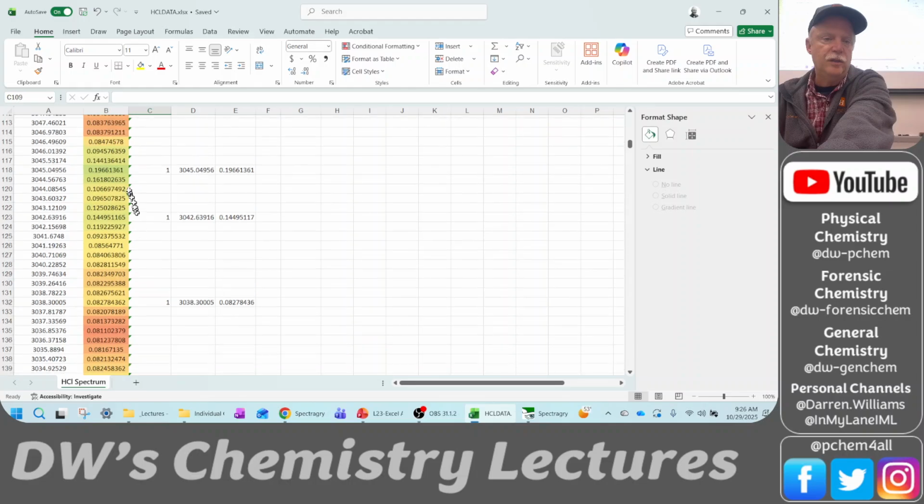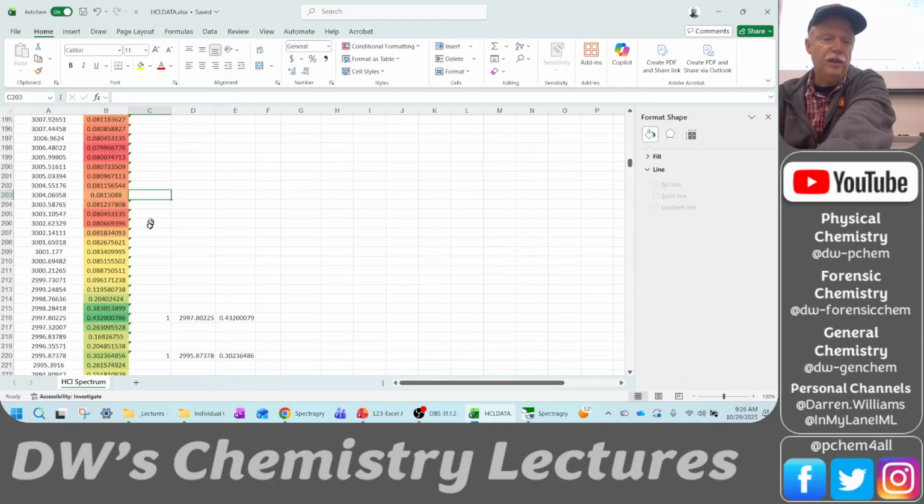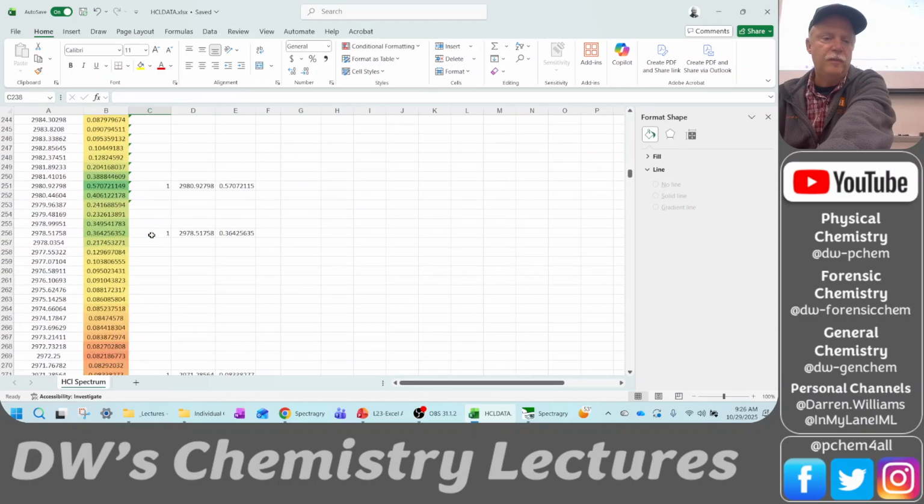Those are good because they're green. You see, they're kind of green. Get rid of that one. These are too close, like adjacent to each other. That's not good. Okay, this is false here. So just clean out all of this noise, and then your assignment will be, your peak picking will be done.